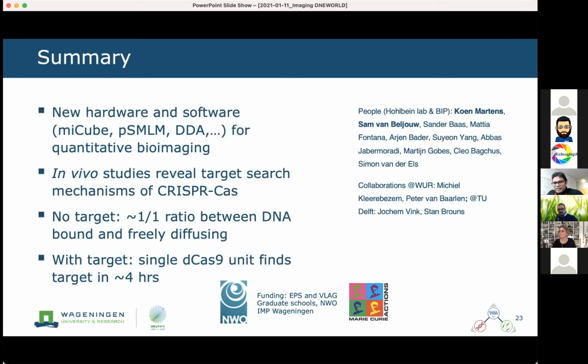Okay, I'll take one very interesting one on open systems, which is from SWB43. How stable is the open system with regards to vibration and temperature changes? And additionally, I would like to know, when you print 3D parts, how good is the tolerance of the system, the materials that you're using? Are these important things? For the 3D parts, it's good enough, because the main block is anyway milled or Thorlabs parts, and the exact arrangement of the filters, left, right, tilt, doesn't really matter too much. What was the first question again? I forgot. How stable is it? Okay, vibration, temperature control.